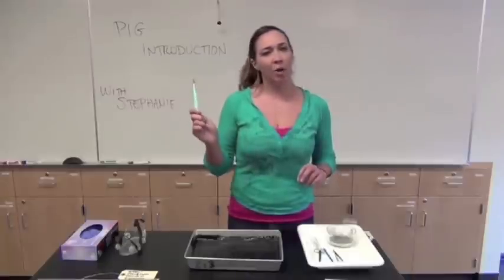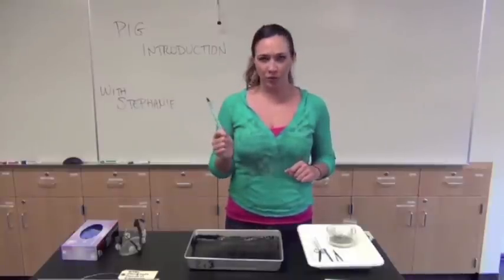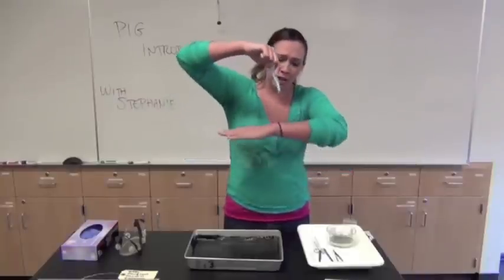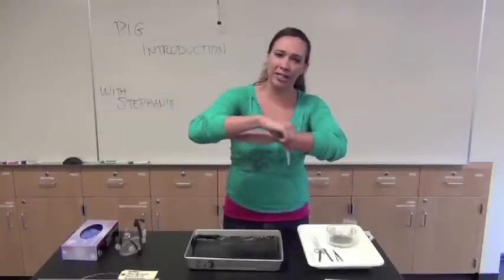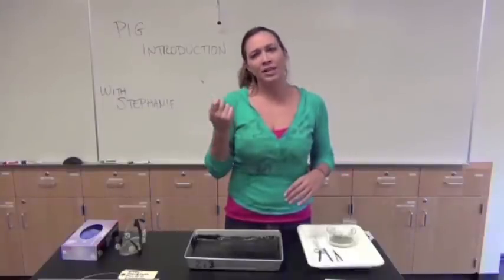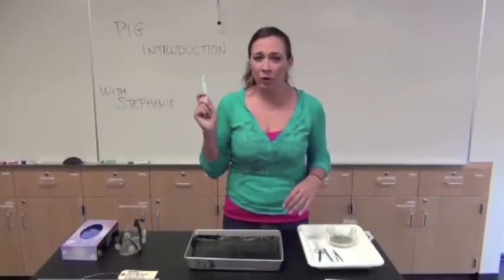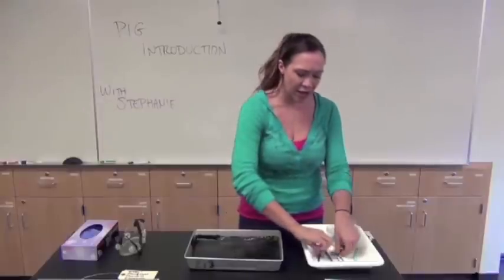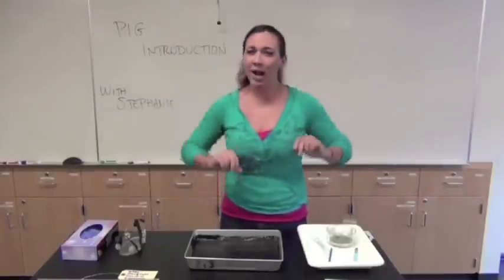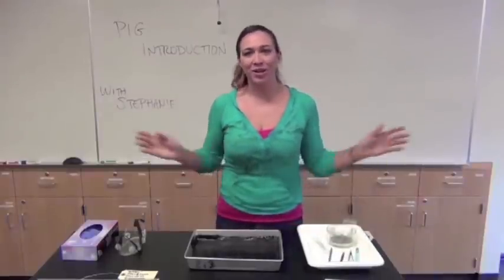The last tool is the scalpel. Most people want to use it, but it's actually not a good tool in our case. The scalpel can be very dull, requiring you to press down hard, and you can't control how deep you go, which can damage organs and fine vessels. Unless you're breaking bones, avoid the scalpel — your best friends will be the tweezers and scissors. Lift and cut at the connective tissue, go nice and slow, and you won't damage anything.